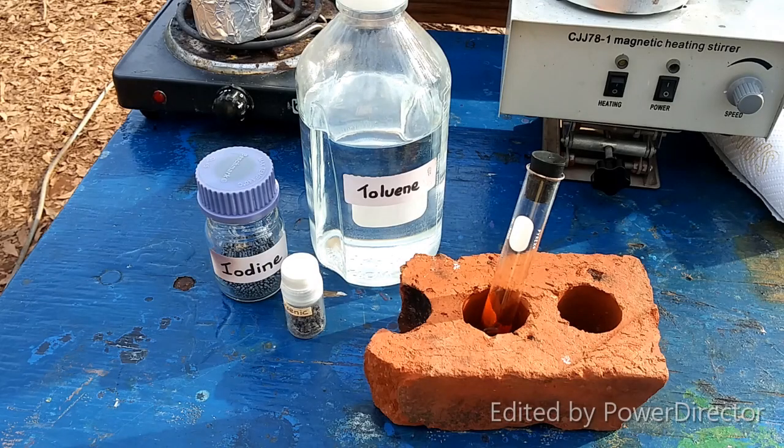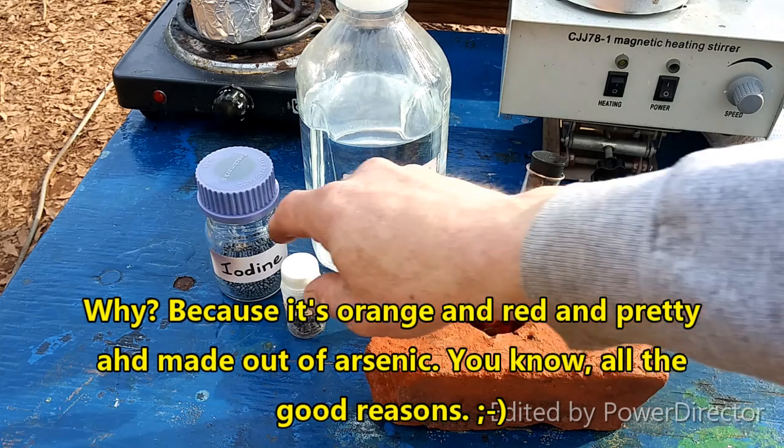Hello everybody, and welcome back to The Poor Man's Chemist. In this video, we are going to be making arsenic triiodide out of elemental arsenic.